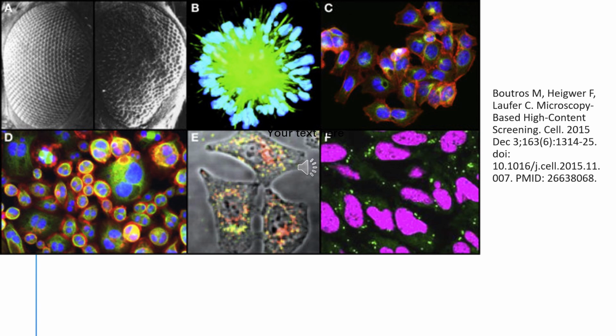In image E, there are confocal micrographs of A549 cells infected with influenza virus and stained for the virus and CD63, where the yellow indicates the virus particles co-localizing with CD63-labeled late endosomes. And image F is the confocal micrographs of L cells after treatment with WNT3A conditioned medium. The nuclei are stained, and formation of lipid droplets is visualized with BODIPY 493/503 staining.